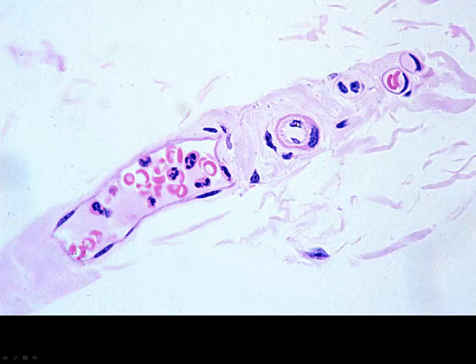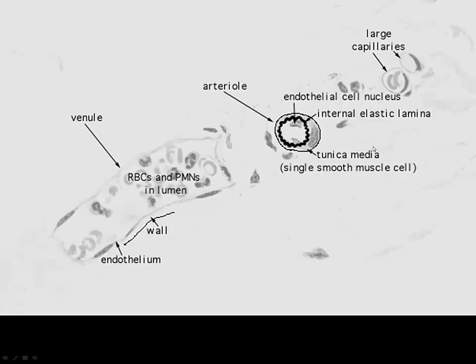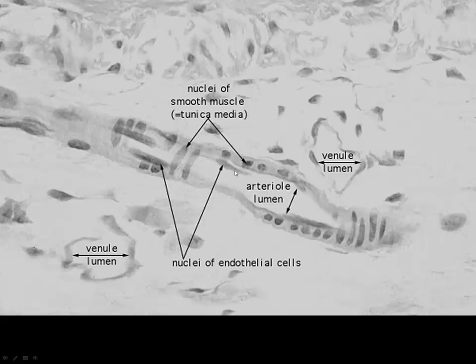Here we have endothelium, and we have 1 cell around. So we are really getting close. I mean, this would be a very small arteriole, but then we absolutely have capillaries here. 1 endothelial cell, the diameter is that of the red blood cell. Once again, we have this vessel, our endothelium.